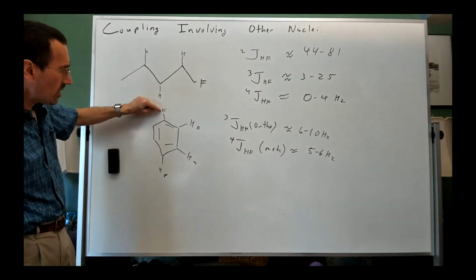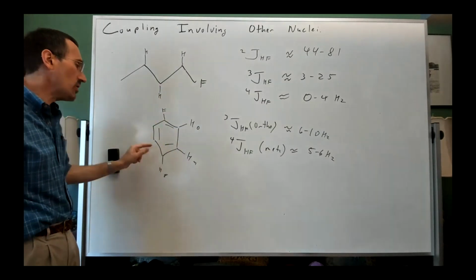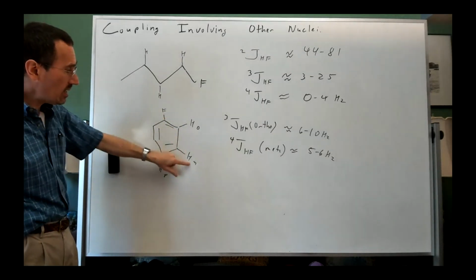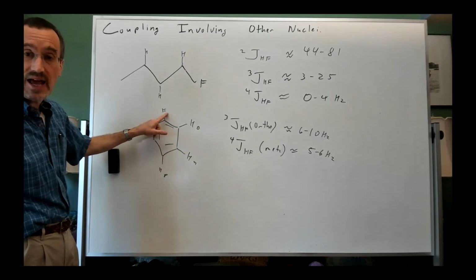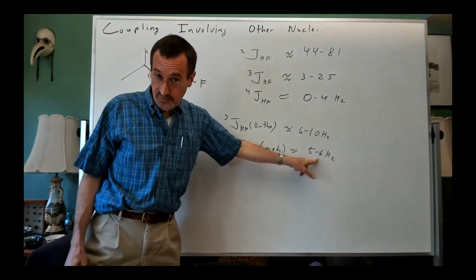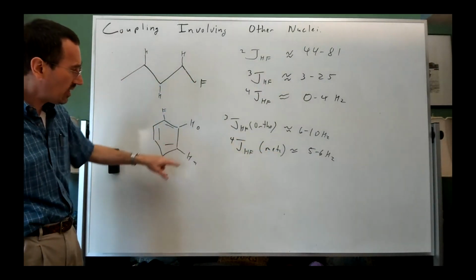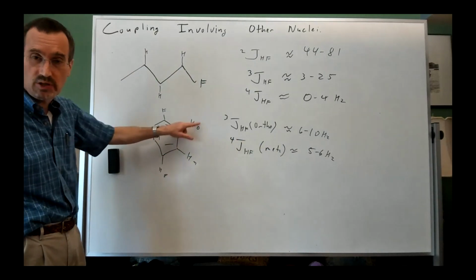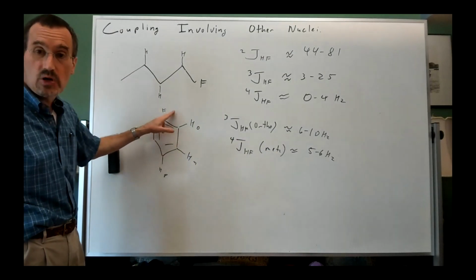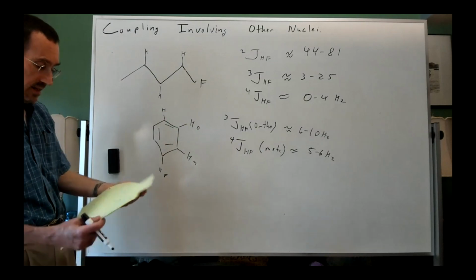But with the fluorine over here, rather than say a chlorine, you wouldn't expect meta coupling, although it would be non-first order. With a fluorine here, this hydrogen is now going to have a still pretty large coupling to fluorine. So it's going to really surprise you, in the sense that you're looking for something that should look like a triplet or have two big J's in it, and there's going to be another big J. And you'll see examples of that in the homework.